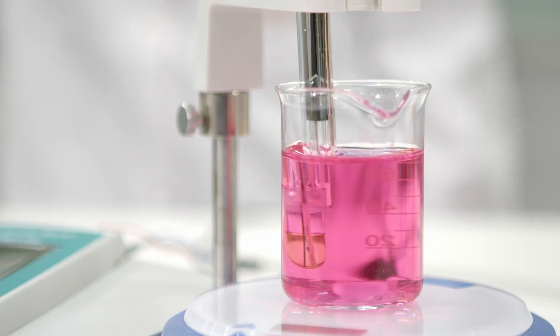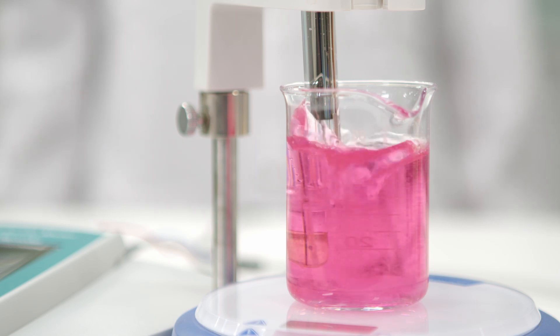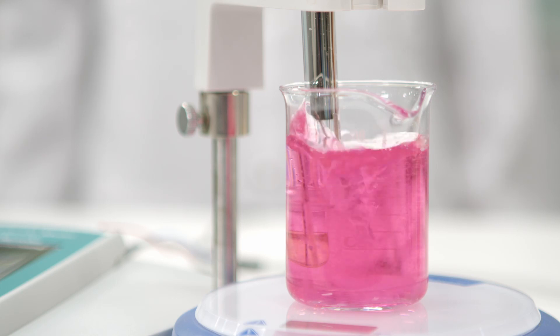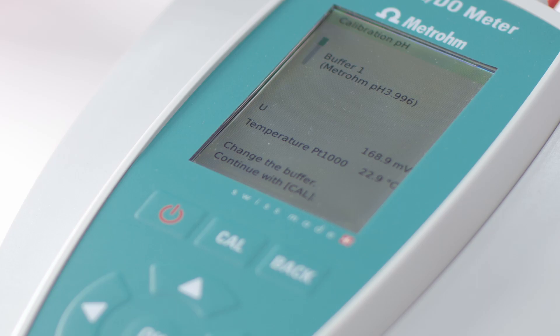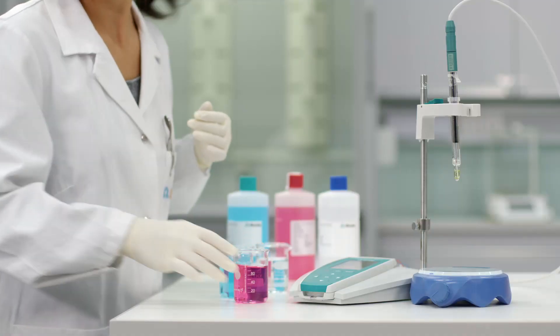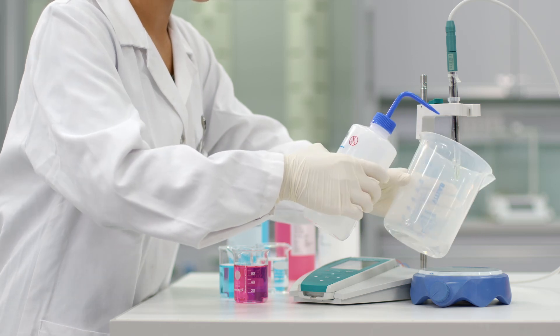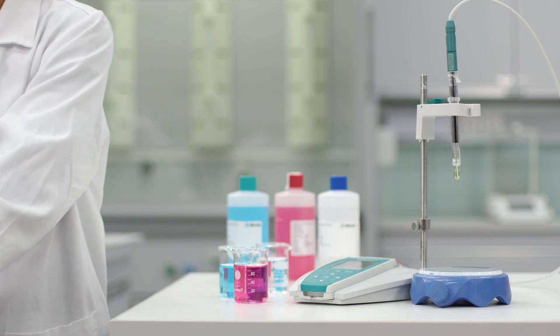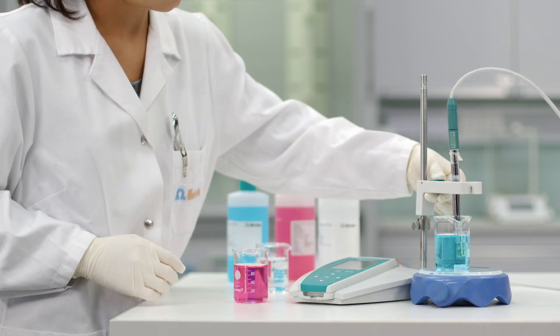Make sure you gently stir the buffer solution. Vigorous stirring leaves your pH electrode hanging in the air. Also, it will increase the uptake of CO2, which can falsify the pH value of your buffers. Your meter will automatically recognize the buffer you have used and show when it is time to change the buffer. Before continuing the calibration with the second buffer, rinse the pH electrode with deionized water. Now immerse your pH electrode in the second buffer and press CAL.